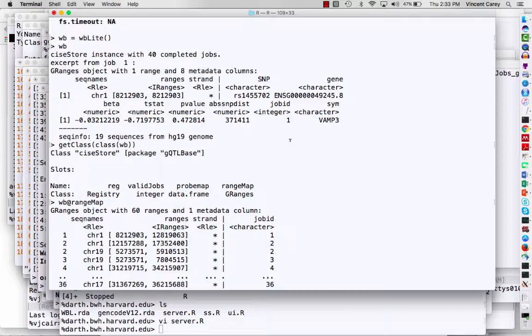This is one case where the data have been distributed across a large number of GRanges, which can be found rapidly and loaded rapidly because they're relatively small. But there are many other ways of dealing with this data distribution and query resolution, and we need to do experiments and benchmarking to figure out which ones are going to be effective for the types of analyses we want to do. The browser, of course, has very limited use.